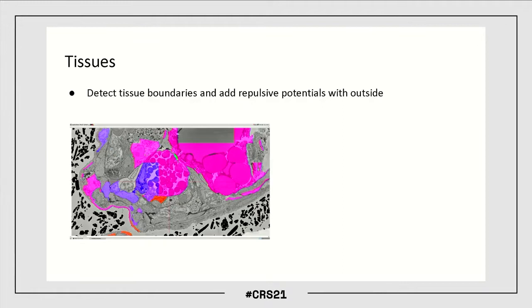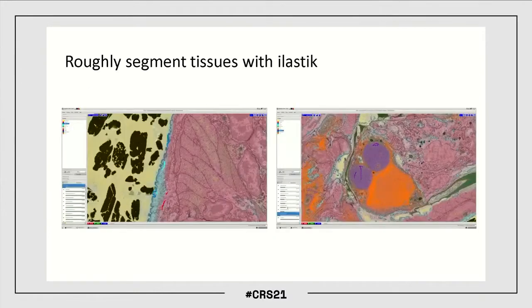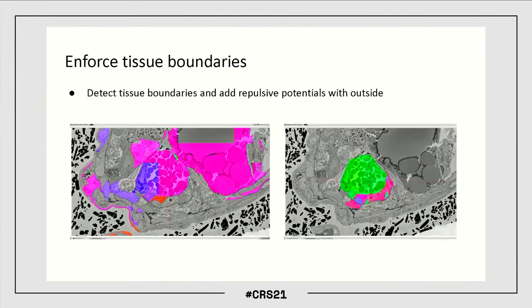And then if you have a horrible segmentation error, like the one that you see there, where some boundary was not detected and it just overspilled and overmerged into a catastrophic merge, right? Then we can put some tissue boundaries on top that we can easily predict from a very downsampled image, right? And then it can actually become a nice segmentation.